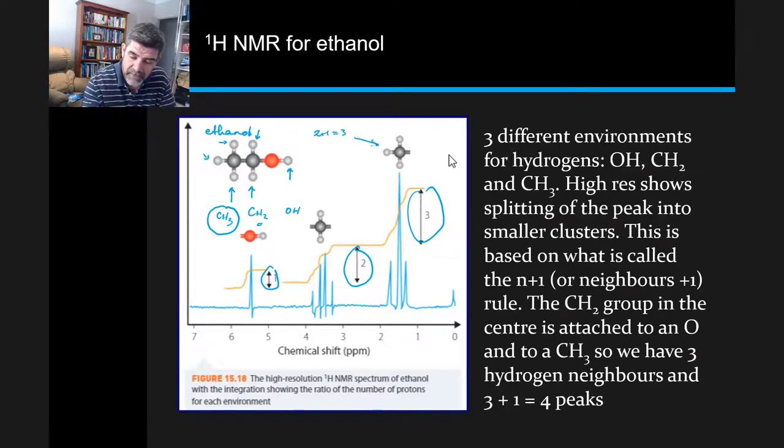So for this particular species here, we have a neighbor that has one, two, three of these little cluster peaks, and therefore must be three minus one, which is two hydrogens.